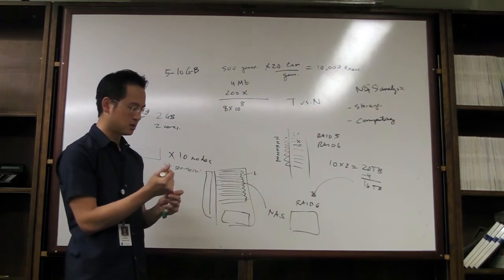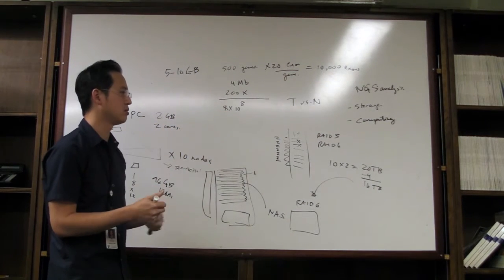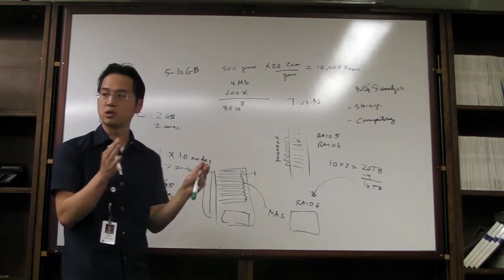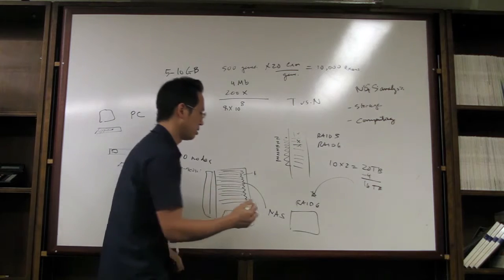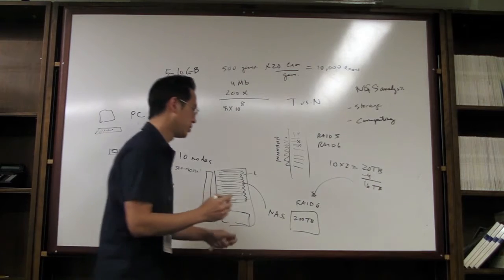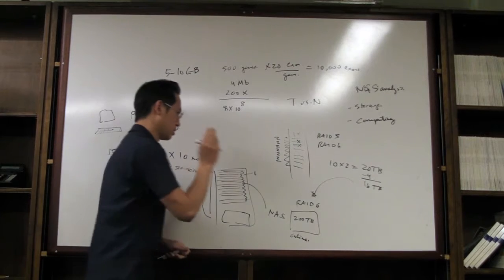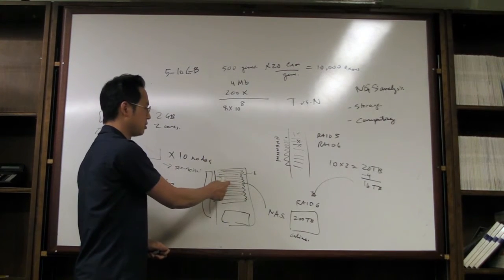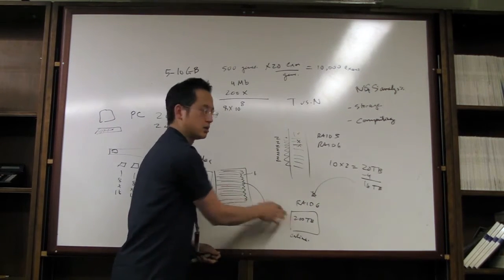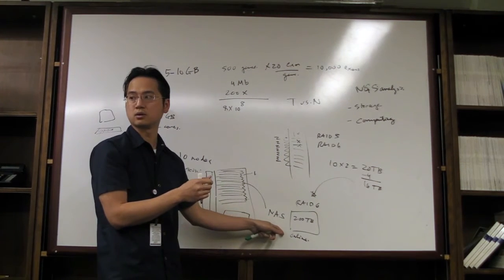Operationally, for the amount of cases that we're doing, for this data size, for the 50 cases a week or so, I think we need basically a 3 to 6 month window of data. We would probably need on the order of 200 terabytes of data storage. And this will be the online storage, so immediately accessible. So you can say, go in, pull this case out, put it into the computing system, the cluster, do the analysis, save the files, push it back to here. This is only for computing. It won't be storing any data if you use a network attached storage server like this.